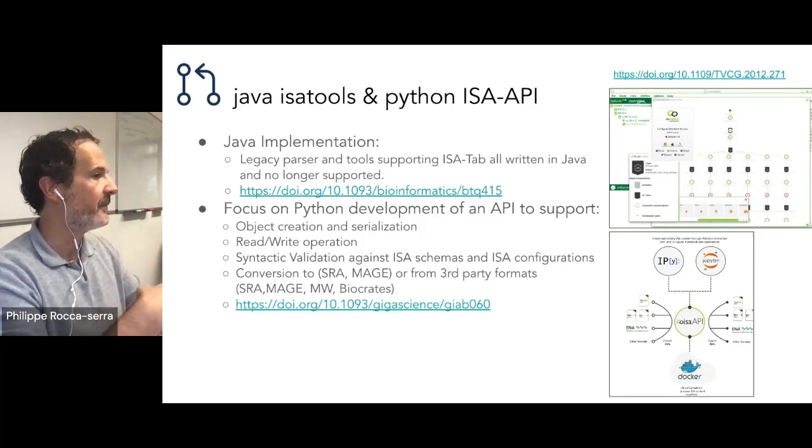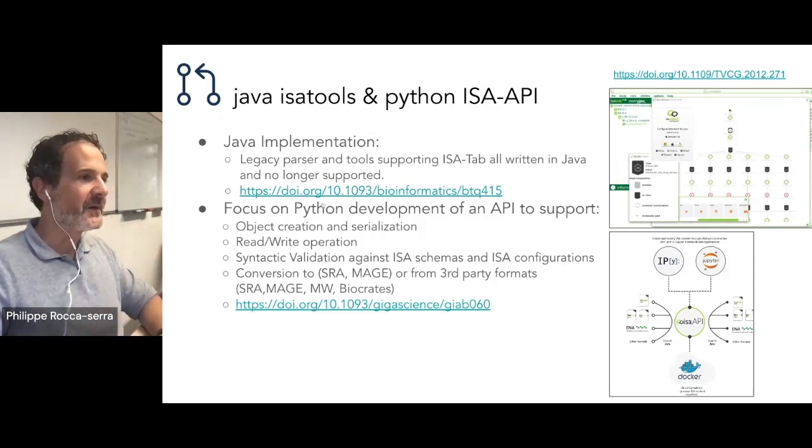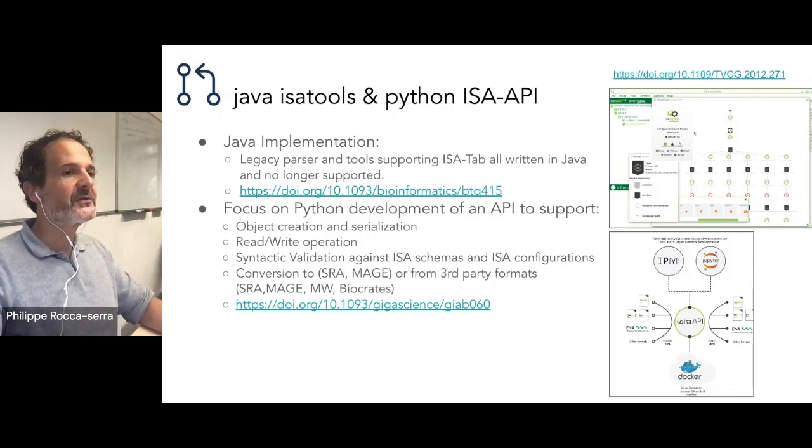Typically, in the case of a multi-omic or of a transcriptomic assay, you will have to run to acquire the raw data and then normalize that. So the step of normalization can be tracked. You've got a pooling effect. And the reason why I'm mentioning this is because we developed a series of tools. The initial tools were developed in Java, and they were the ISA creator software tool that you can see here.